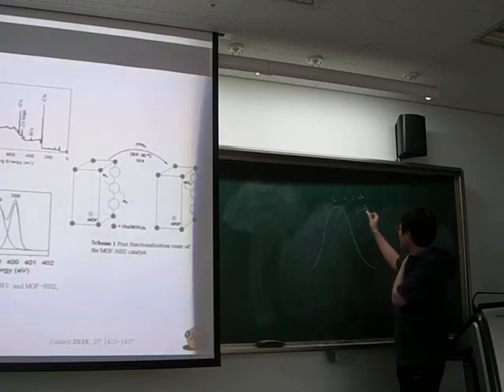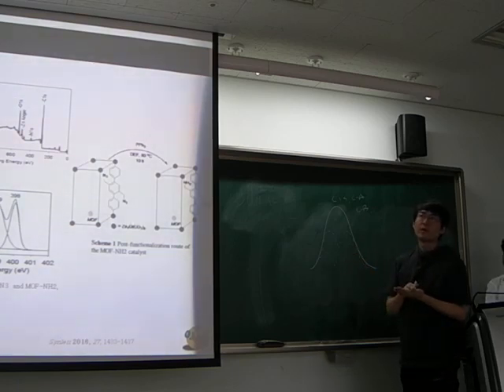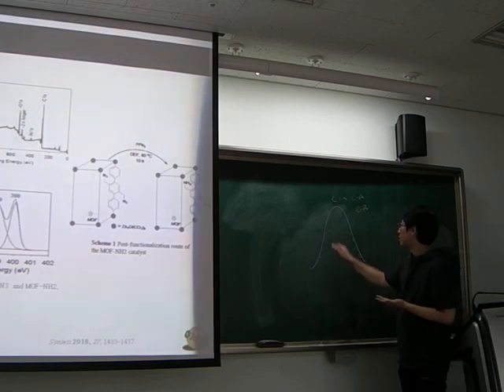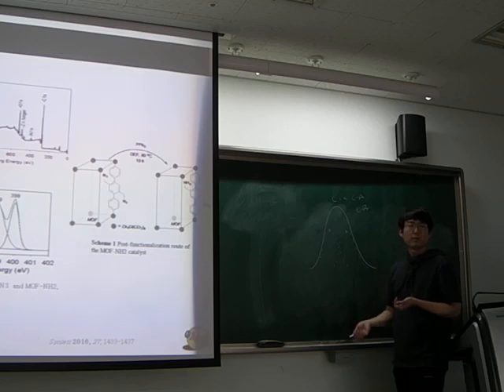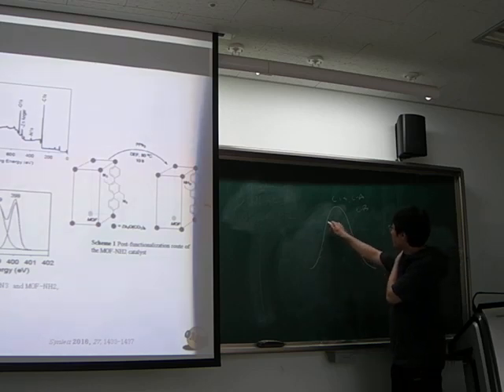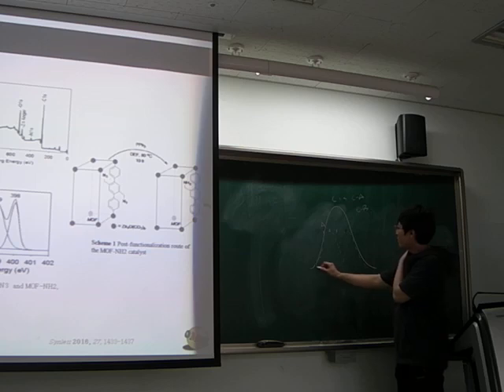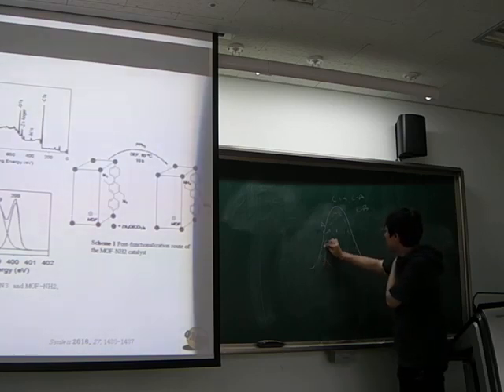So when you do this, you should be doing the CA position and CAB position and set your position and calculating to software. It can 알아서 automatically divide this peak. So think about when the A peak is located here and B peak is located here, and you do the calculate, the dividing peak appears like this. Understand? The dividing peak appears like this.